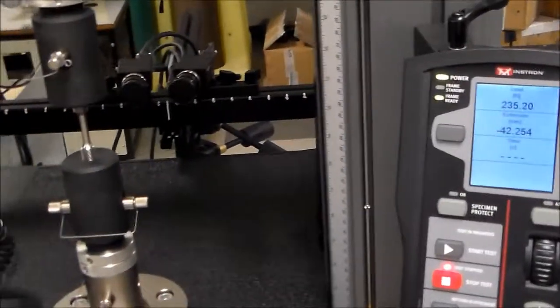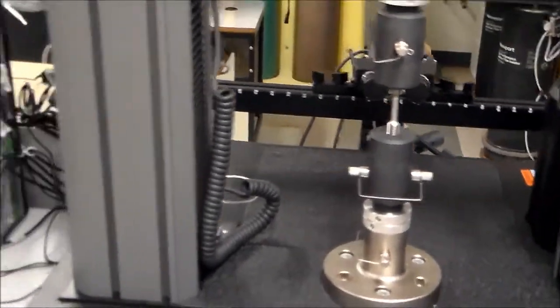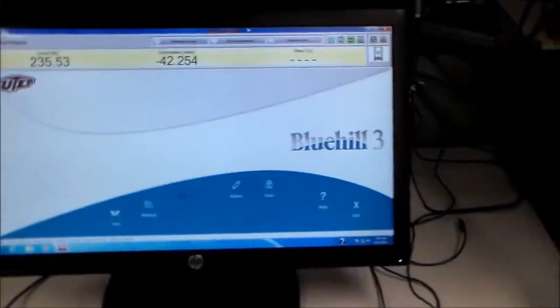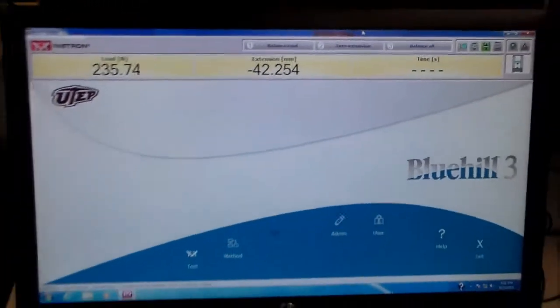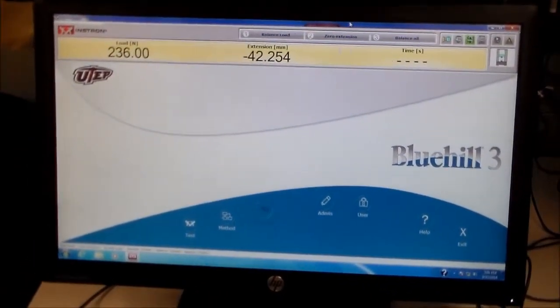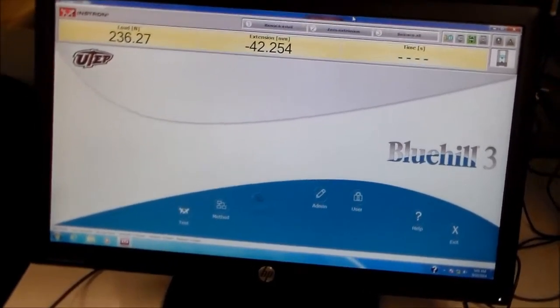The frame is ready to run a test, but before running a test we need to know how to write a test method in the Bluehill 3 software. In the next tutorial, I will show how to write a test in Bluehill 3.